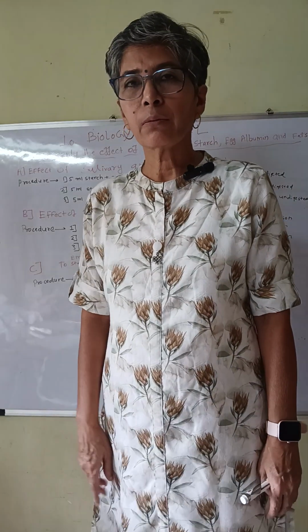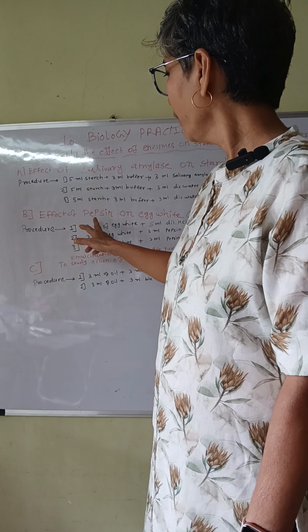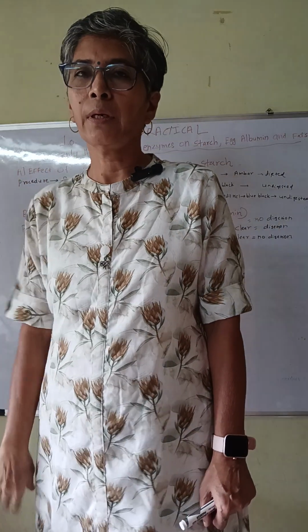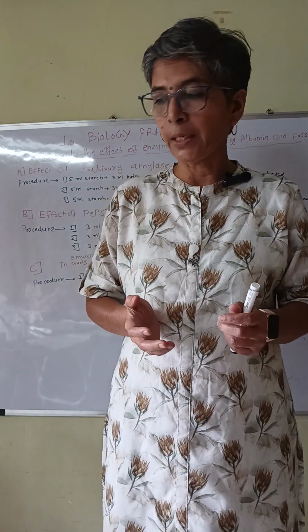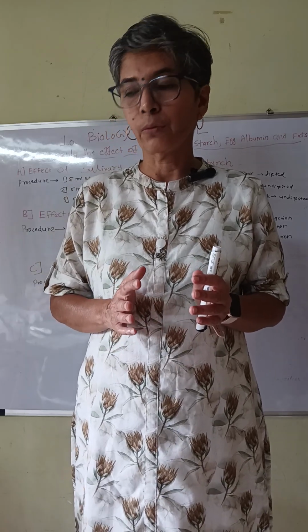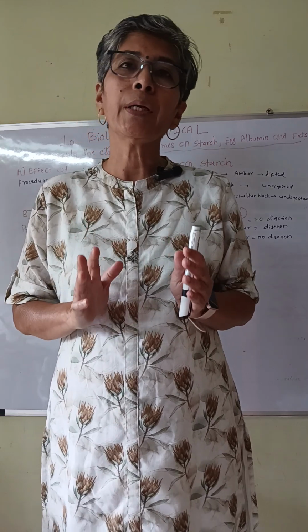So the principle for this activity is related to the enzyme pepsin. Why pepsin? We are using the enzyme pepsin on egg white, and we are going to see the results. Pepsin is a protease enzyme. It is used for digestion of protein. It breaks down proteins into peptides.